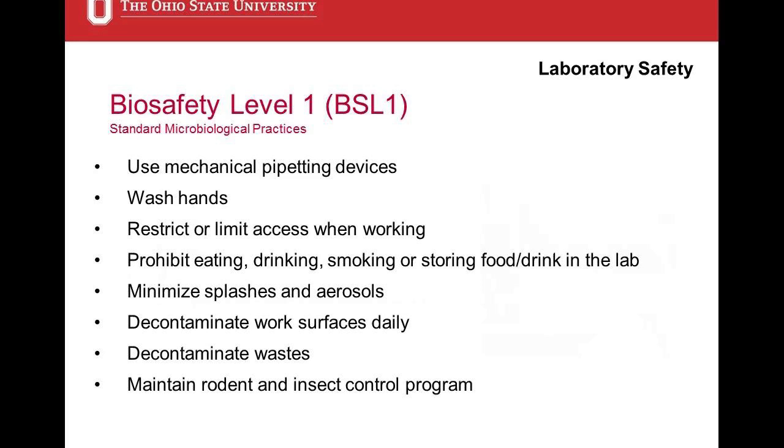It's a very bad practice, and we've tried to talk to most of the lab designers and the building coordinators to try and find spaces outside of the labs where you can have lounge areas or lunch rooms. But at a minimum, you have to have a little table outside in the hallway where you leave your coffee or your waters or whatever it may be. Minimize splashes and aerosols. Decontaminate your work surfaces every day. So when you're done working, you need to wipe down your work surfaces. Decontaminate your waste appropriately.